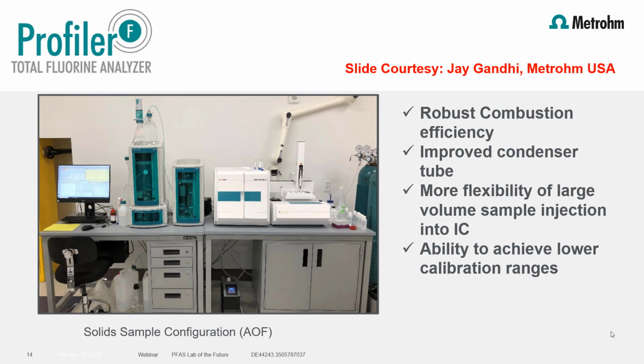So this is really a sensitive instrument for what it's worth, and something that can give you fast and rapid surrogate information on total organic fluorine. One of the slight disadvantages here is, of course, it requires a solid phase extraction sample preparation, and that in itself can actually take some time, while potentially also adding a little bit of background to the system as well. So something to be aware of. But these are the surrogate ways of looking into it.